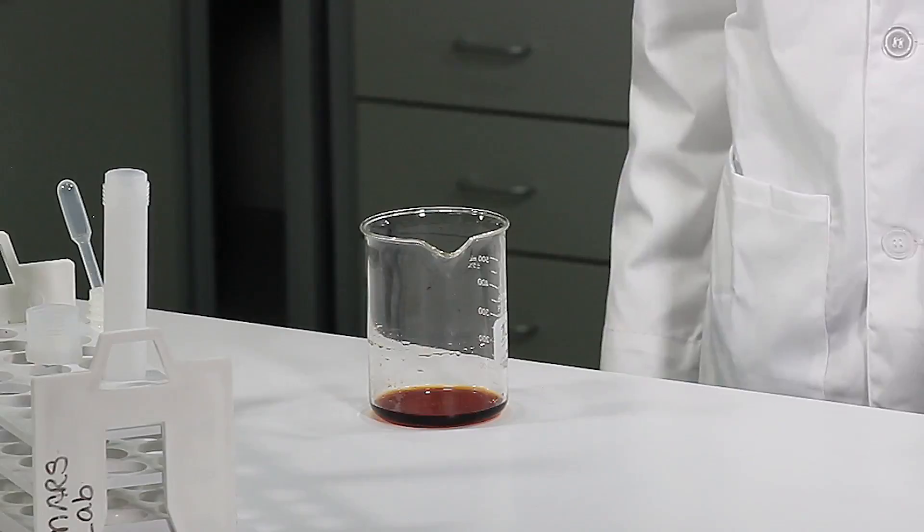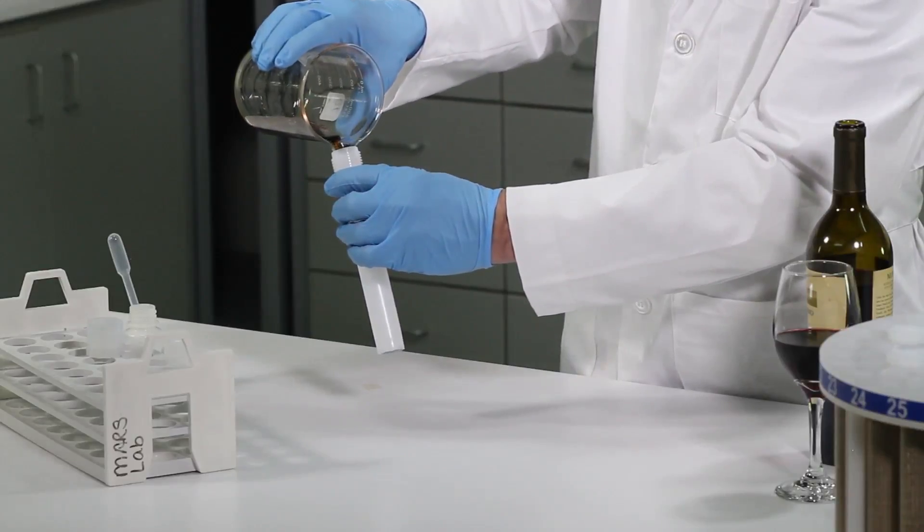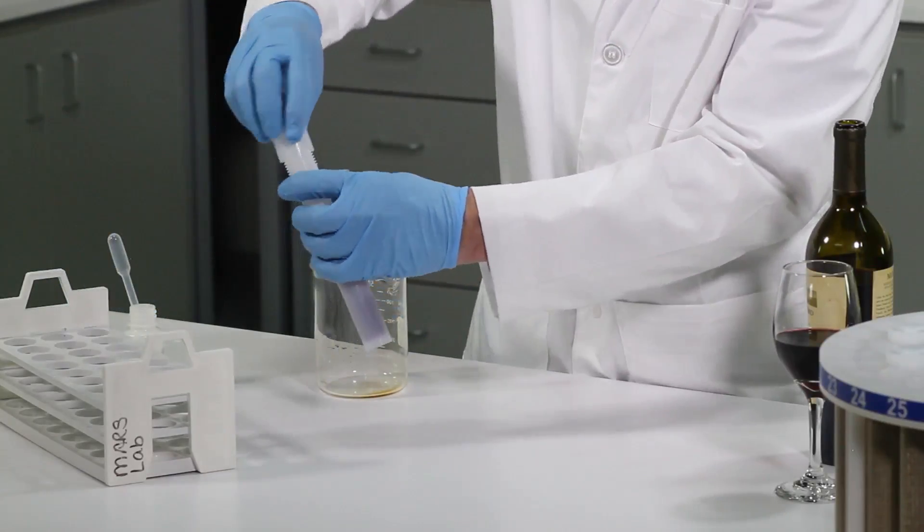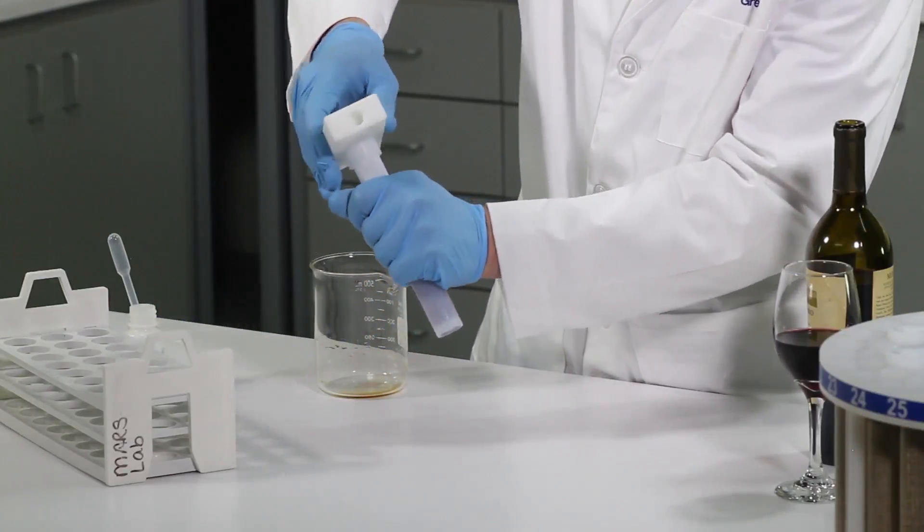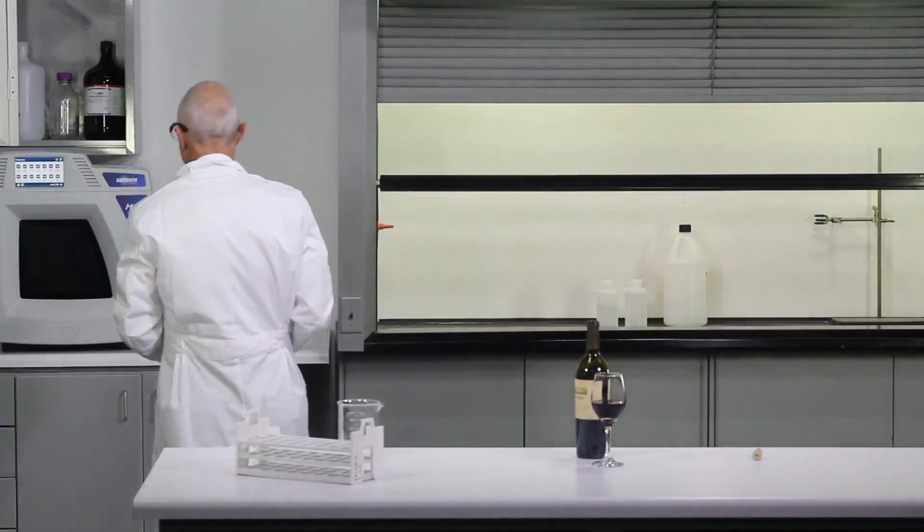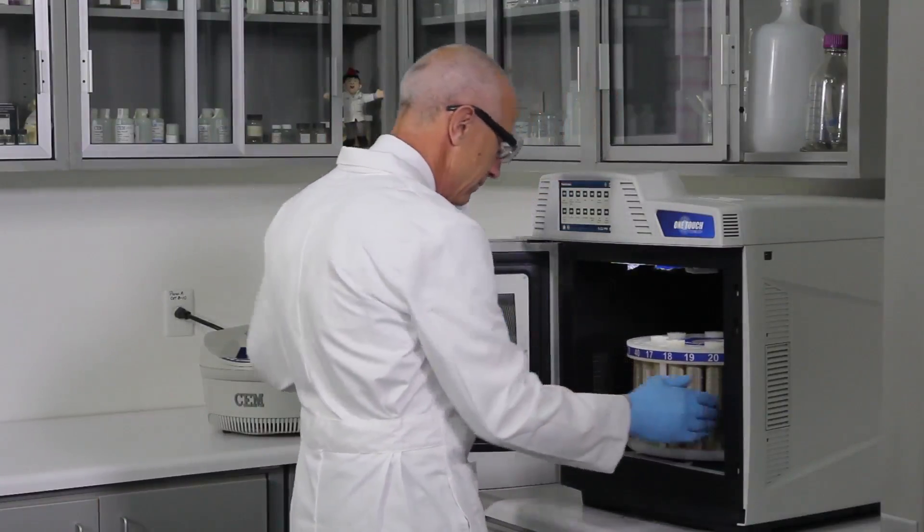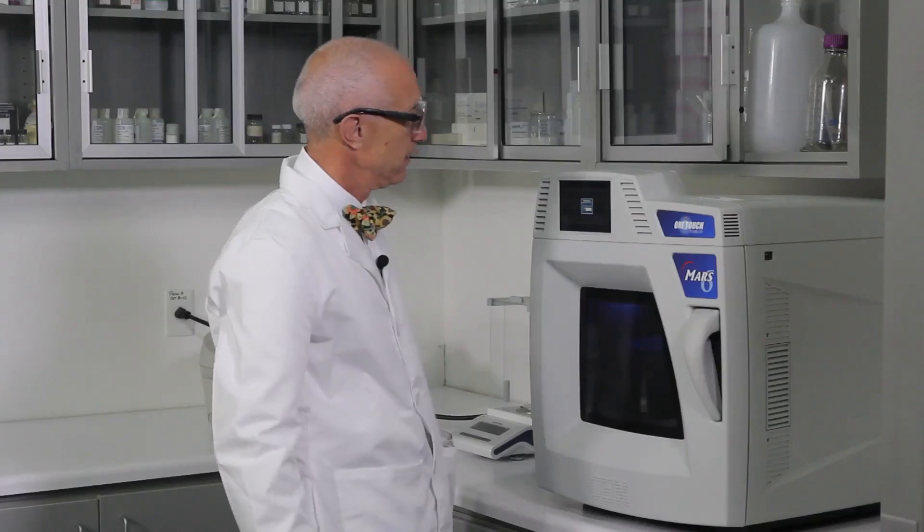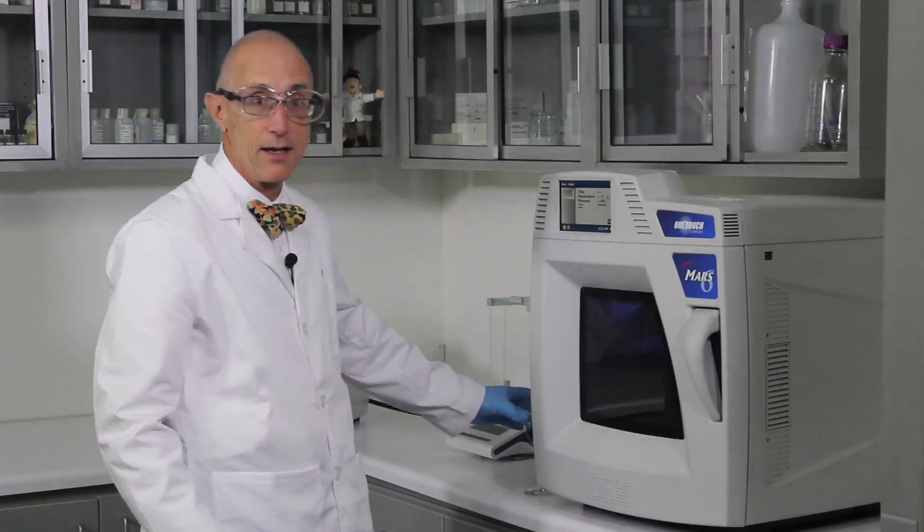Now that the pre-digestion has subsided, we can seal the vessel and put it in the microwave. Into the turntable, turntable over to the microwave unit. We'll load our samples into the cavity, close the door, select our method. It's loading. Then we're going to press start. Keep our product near at hand. Might need that.